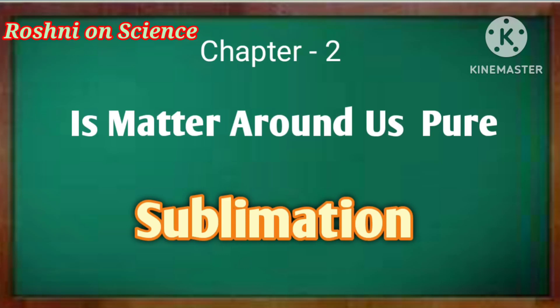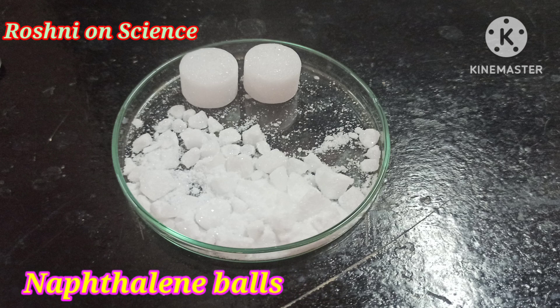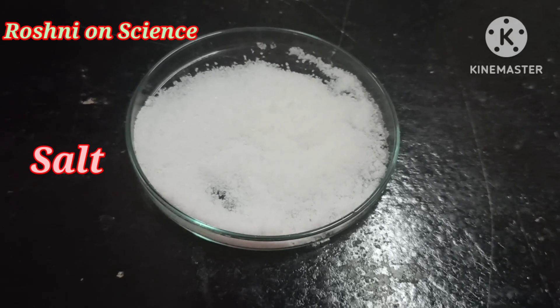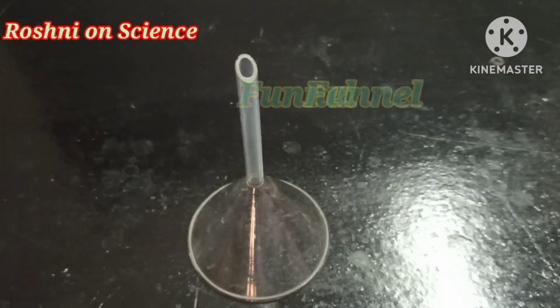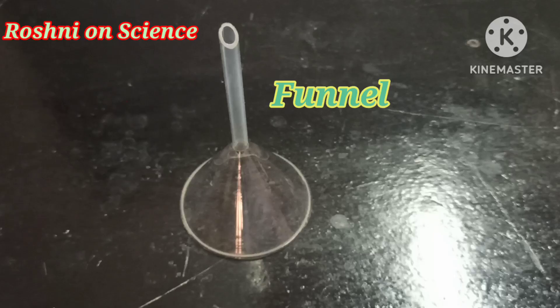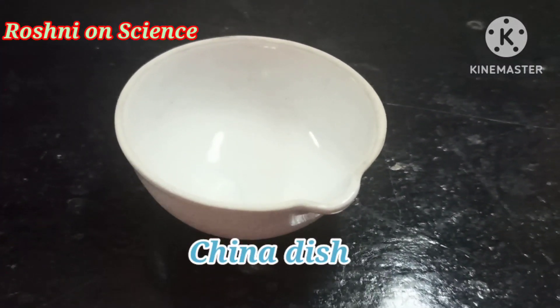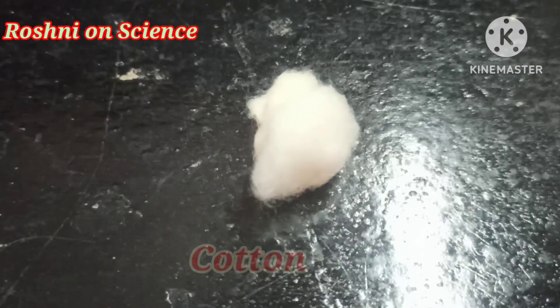Sublimation. For this activity, we need powdered naphthalene balls, salt, funnel, china dish, and cotton.